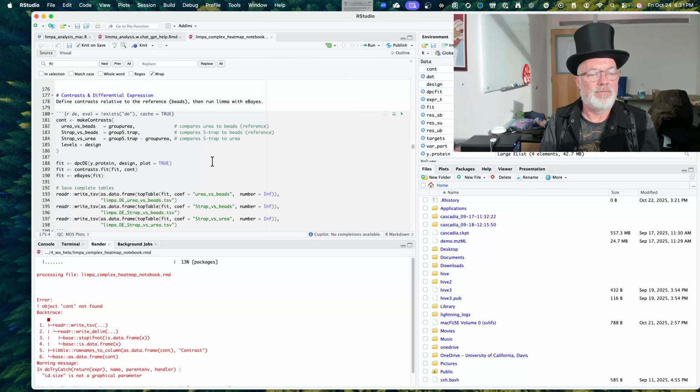Now that it knows what conditions are what, it will try to figure out, using modeling, what's most likely due to random chance of just missing, and what's most likely to be there for real, like large intensities that you should see all the time. It takes those probabilities and those errors and weighs them in the formula. So it gives more credence, I think, to things that should be seen all the time. I think that's the gist of it.